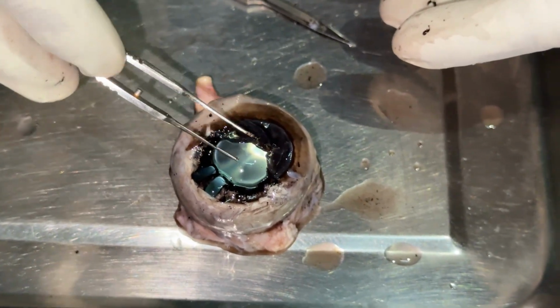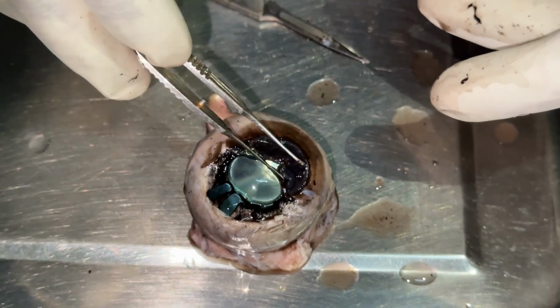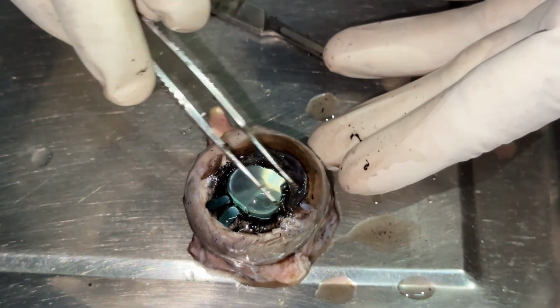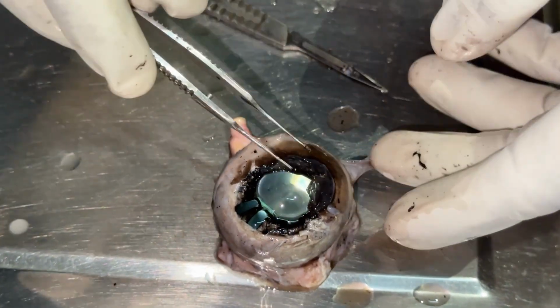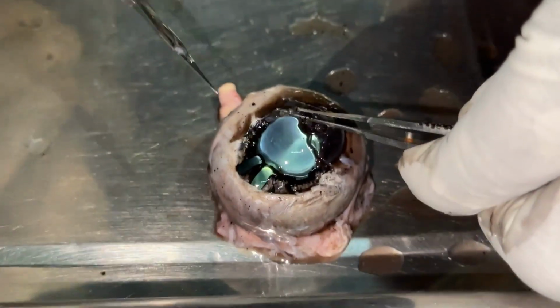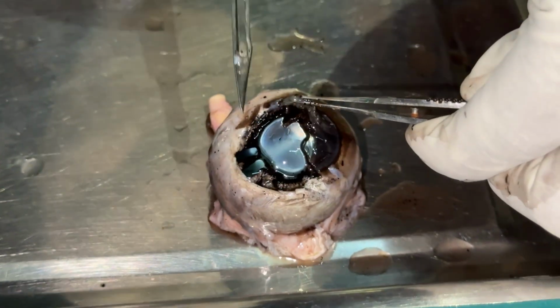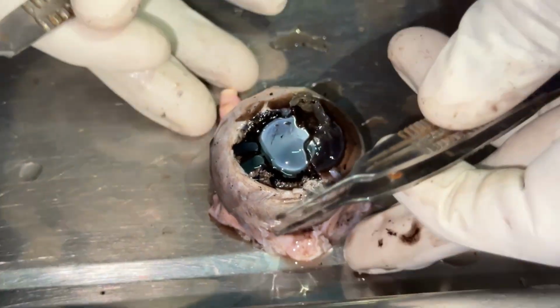This is the iris muscle. When we put a dilator, these muscles will undergo contraction and this area will be smaller. Actually, this area is the pupillary margin. This will be exposed. I will incise it. Iris muscle I will remove. Understood? What is iris?